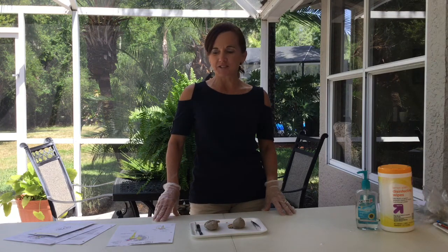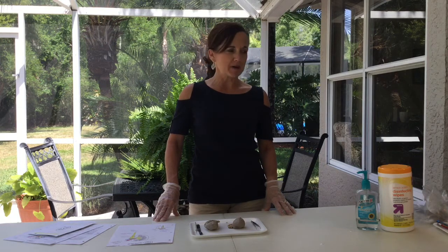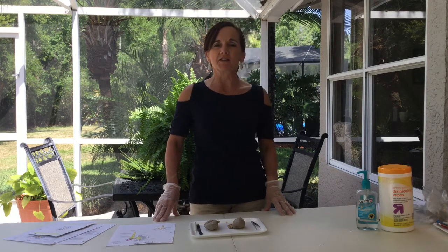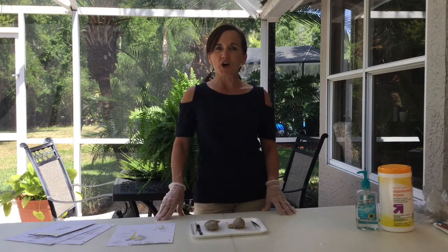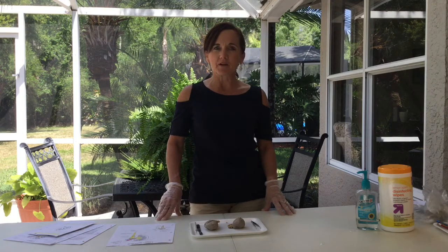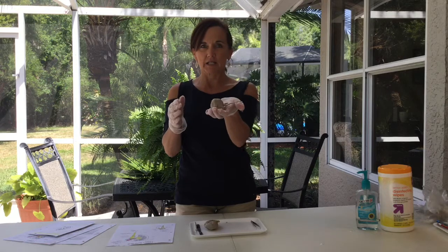We have another dissection today. If you are in my general science class, we are in module 15, which is talking about 3 body systems. We're doing the lymphatic, the endocrine, and the urinary system. Today we're going to focus on the main organ, a part of our urinary system. So today we are going to be dissecting sheep kidneys.